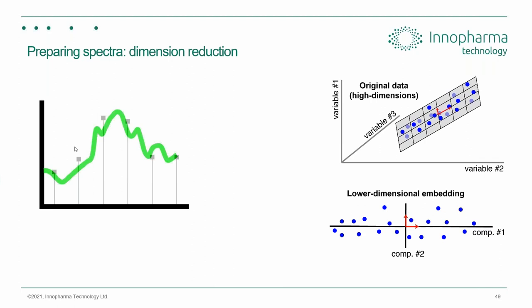So principal component analysis and partial least squares regression, any kind of regression, the first step involves reducing the number of dimensions, the number of variables, to only those which actually change with the change of interest, in our case, a change in concentration. In the illustration shown, you're looking at a three-dimensional graph, plotted against three variables. But had we plotted it against these two components instead, this small set of axes here, we would see that our data is much more spread out, and that the variations between them give us much more information about the real changes in the process.